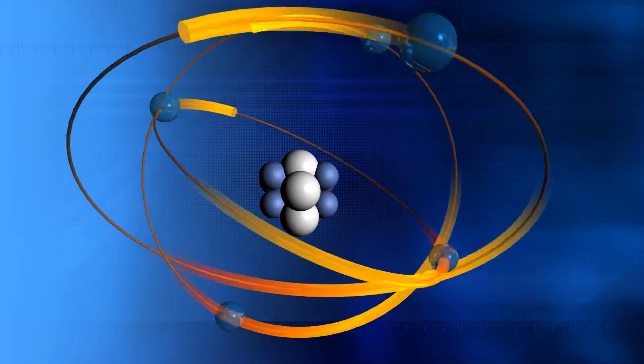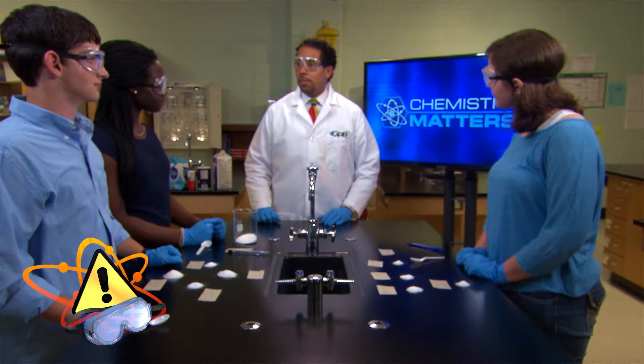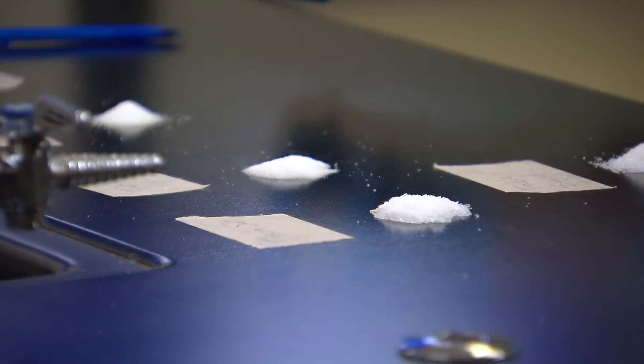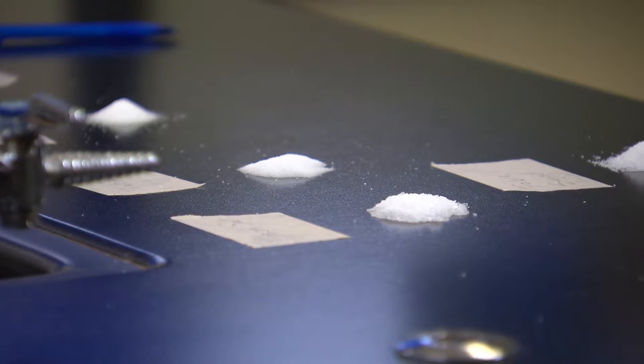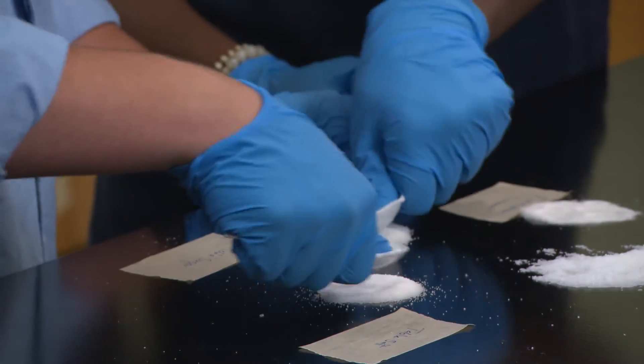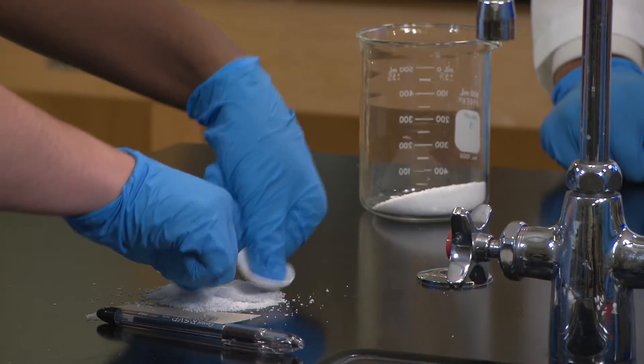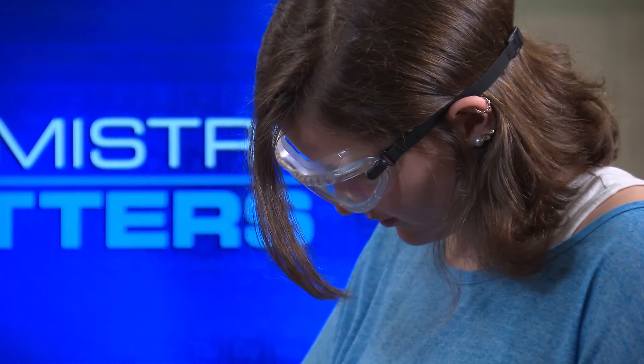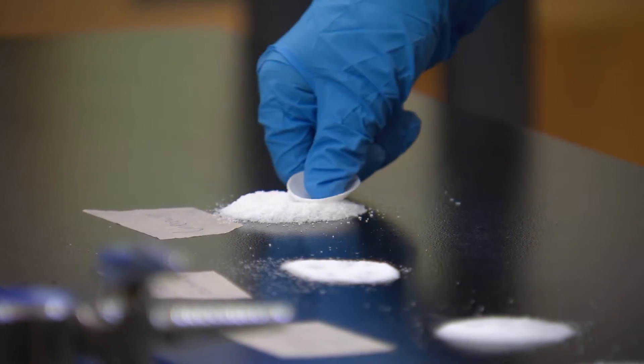Now let's head back to our classroom for a little more hands-on lab work. Glad to see you all wearing your safety goggles — good job. Starting with these four known chemicals, label each and place them on the lab bench, then crush them and record your observations. In any experiment, it is very important to control the variables as much as possible. There are a lot of different ways to crush something, so let's use the same method each time — you might want to use the back of a spoon with your thumb. Label the little piles of chemicals on the table so you don't mix them up, and make sure you wipe off the spoon after you crush each one. Good observations, everyone — now keep crushing.